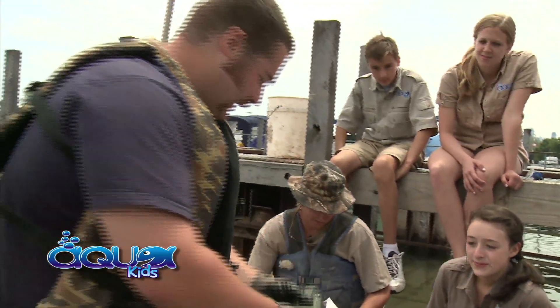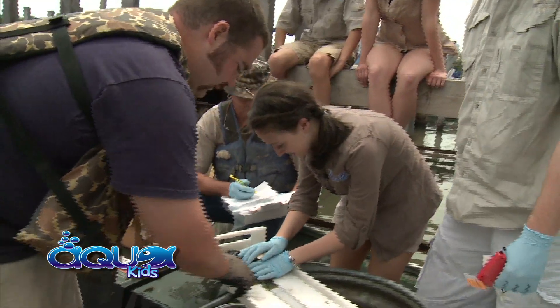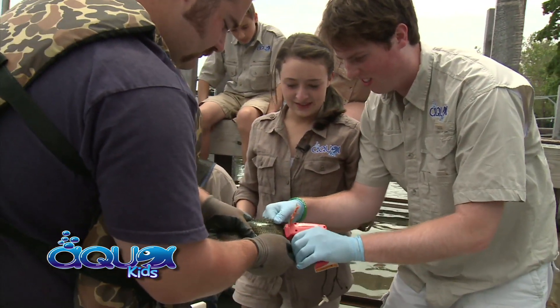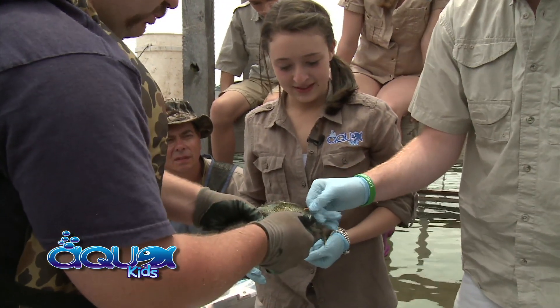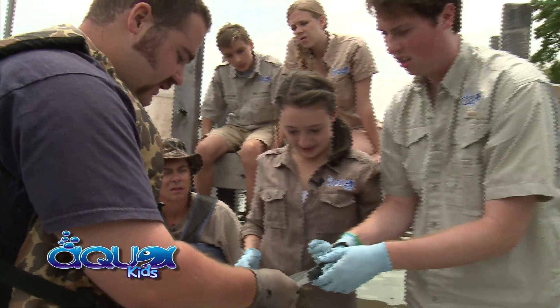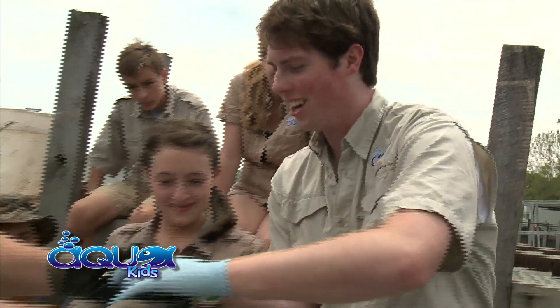We got another rock bass here that we're going to tag. Hold it up against the edge there so we can get an accurate measurement. Looks like it's 230 millimeters. Let's put a tag in it. Push it in, pull the trigger, twist it, pull out. Double check by pulling on it — looks like it's locked in there pretty good. Take the scissors and take a fin clip right at the base. Would you like to release it? Yeah, let's go.